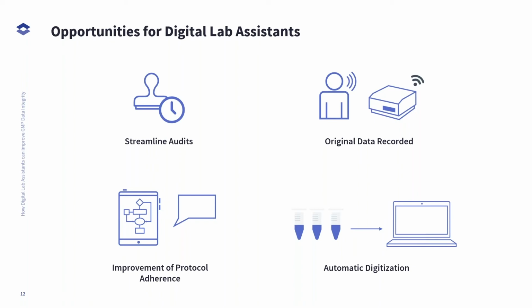I agree with Sophia actually on the protocol adherence. That is a lot of times what comes up during investigations as root causes for having out of specification results potentially, or it leads you to an unconfirmed OOS, and then you find out it was because we didn't adhere to a protocol. So it becomes a human factor root cause, right?